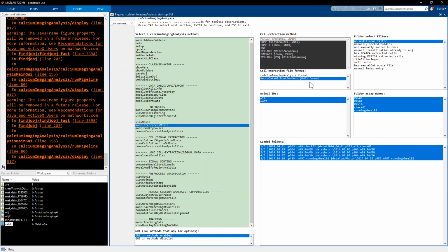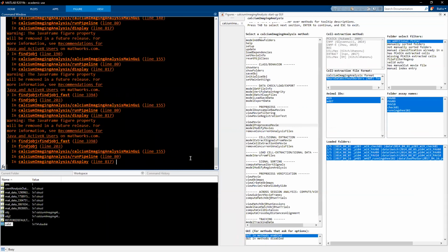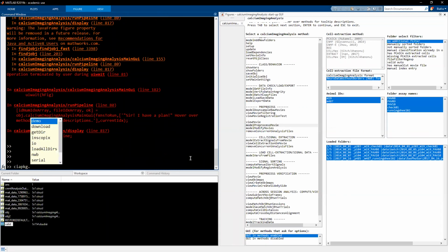But the way it is now, there's a JSON file that will store all the information about a particular movie. So if you really need to go back later and look at a movie file and figure out what information is stored in it, you can do that.